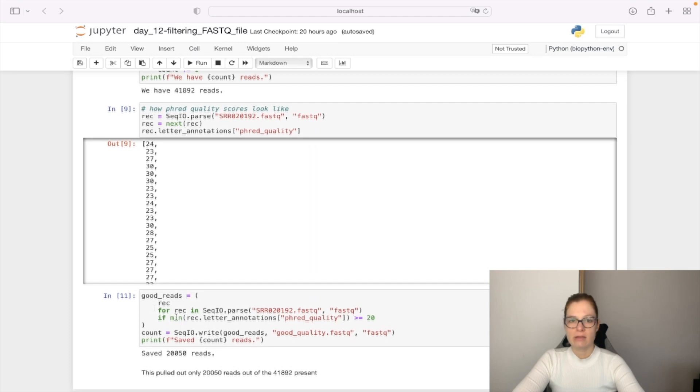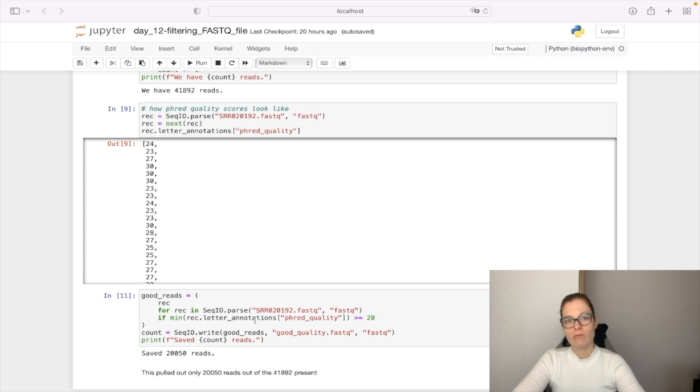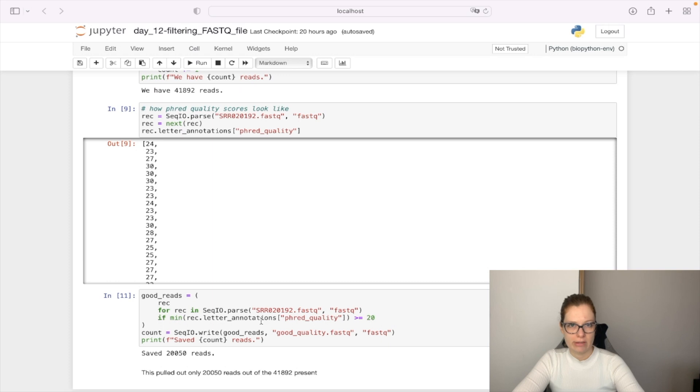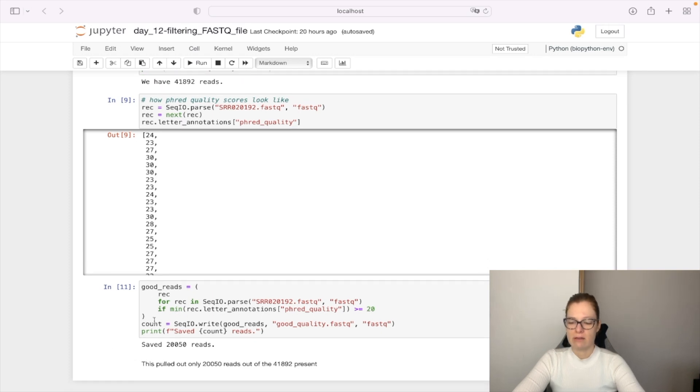The next thing we do is write these good reads into a FASTQ file. When we write, it gives us back the number of written sequence reads. In this case, we saved 20,050 reads.